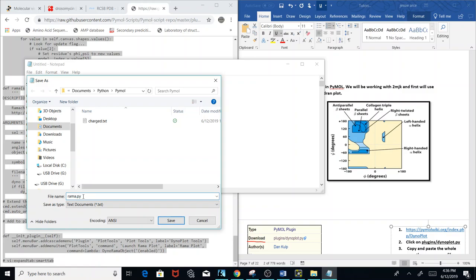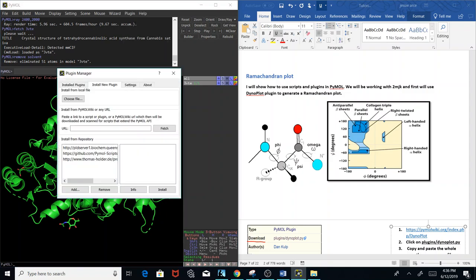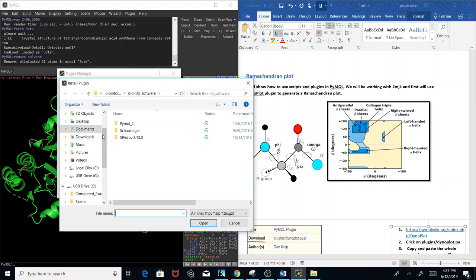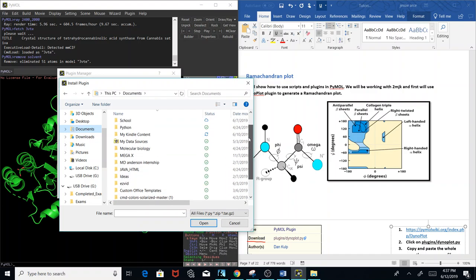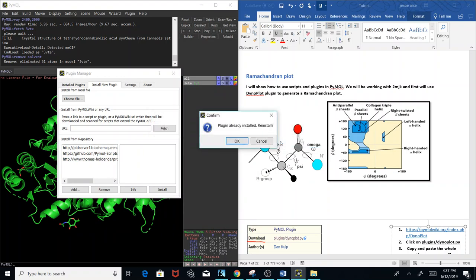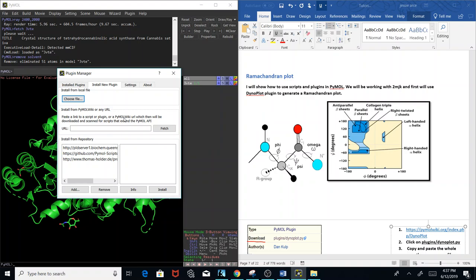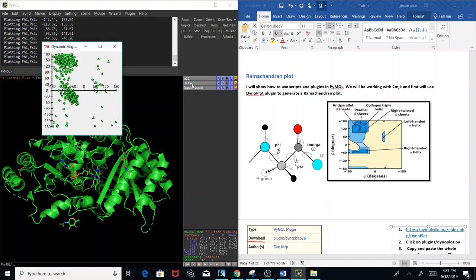Once saved, import it into PyMol: click Plugin, Plugin Manager, Install New Plugin, Choose from File, and find where you saved that file — for instance, 'rama.py'. I already have this installed, so I'll cancel. Once installed, type 'rama' followed by the protein name — in this case '3vte', since that's what PyMol names it. Then here's the Ramachandran plot alongside the coordinate file.